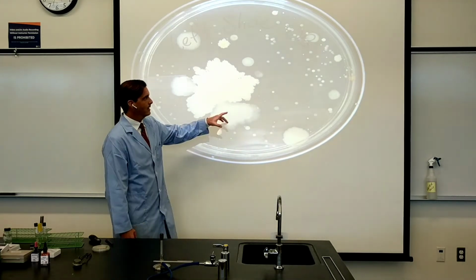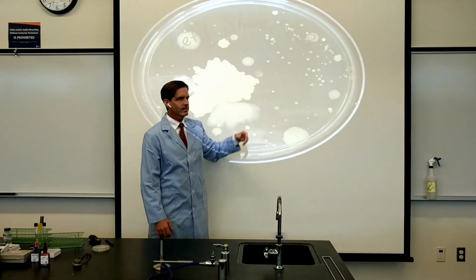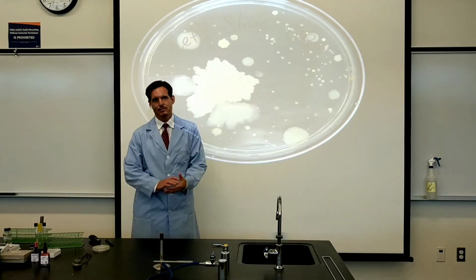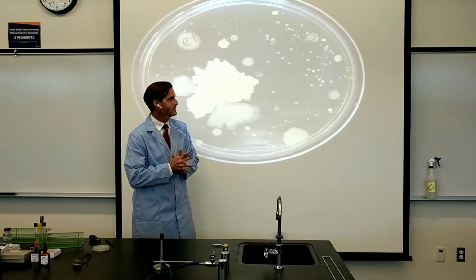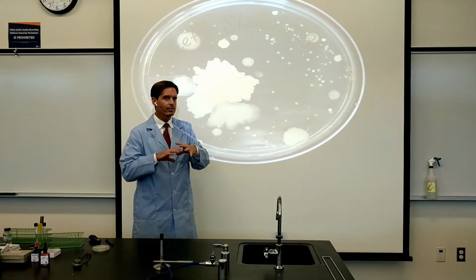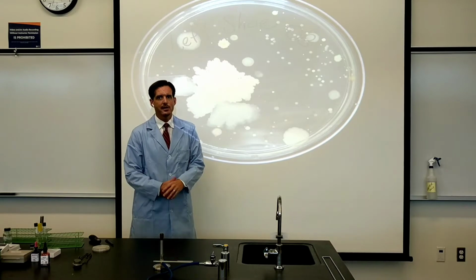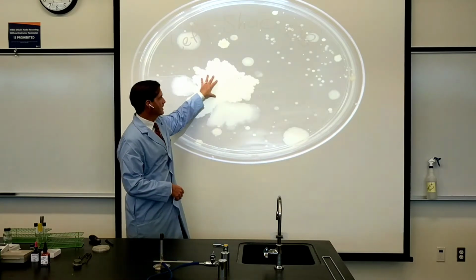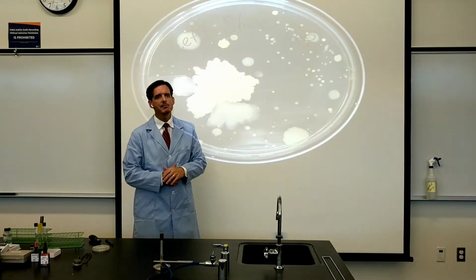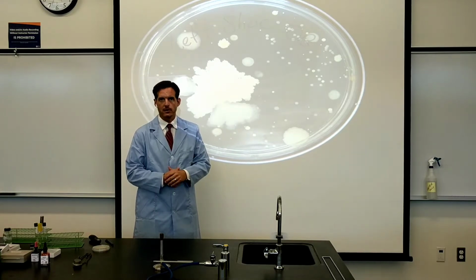They're actually, every one of these colonies, like this little yellow colony, we would call that like a small or maybe pinpoint type colony, that represents 1 million cells. That's impressive. One cell maybe was on there, an invisible single cell, which then grew into 1 million cells. And that visible colony right there, never mind these massive ones, just that little visible colony may have become visible as early as yesterday, over 24 hours or less.